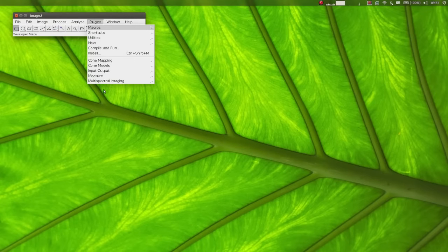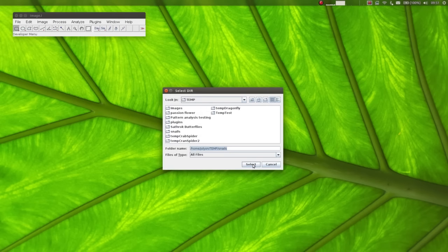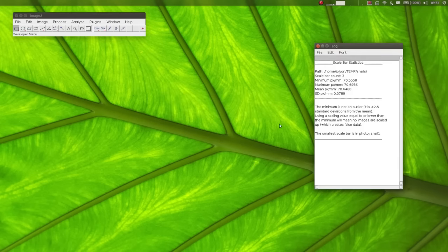Next, we need to know the scale that we need to use when analyzing the pattern on these snails. So the camera might have moved slightly. In some studies, the camera won't always be the same distance exactly from the targets. So we'll want to know what scale to use. You can calculate the best scale to use with a built-in tool here. When you go image analysis, batch scale bar calculation, and select the folder containing our snail mspecs.